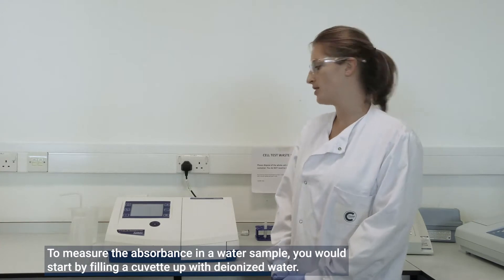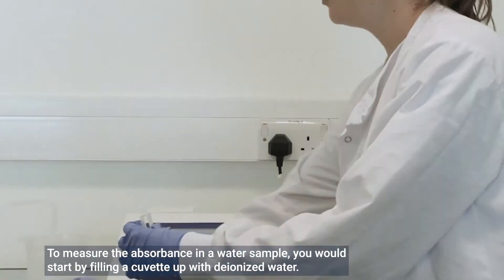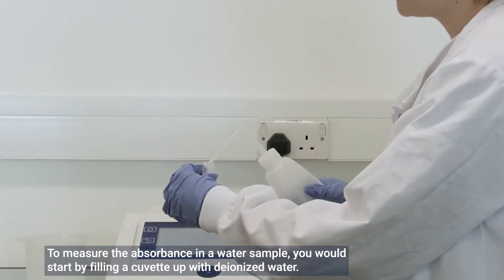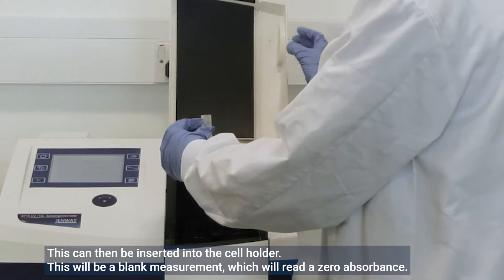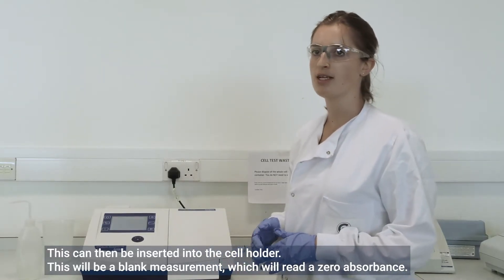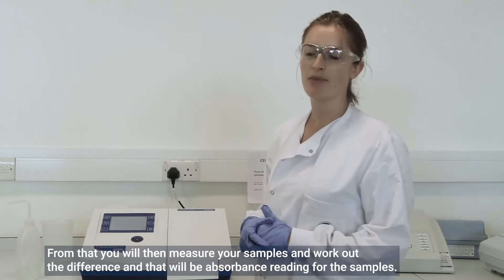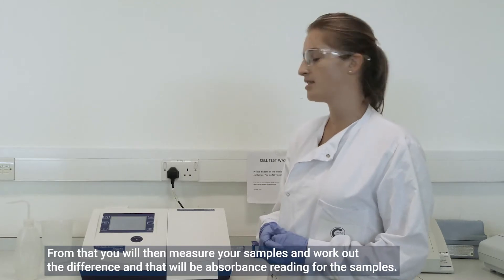To measure the absorbance in a water sample, you would start by filling a cuvette with deionized water. This can then be inserted into the cell holder. This will be your blank measurement, which will read as zero absorbance. From that you will then measure your samples and work out the difference, and that will be your absorbance reading for the samples.